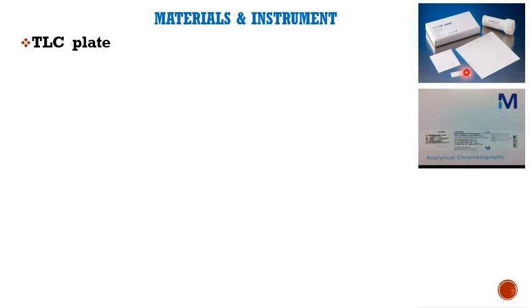So in order to be able to put it in a glass jar, we cut it into smaller parts, each 2.5 centimeters. And in this shape and in this size, you will be able to place it easily in the glass jar. So when you're in the section, you will be given this sheet and not this sheet.